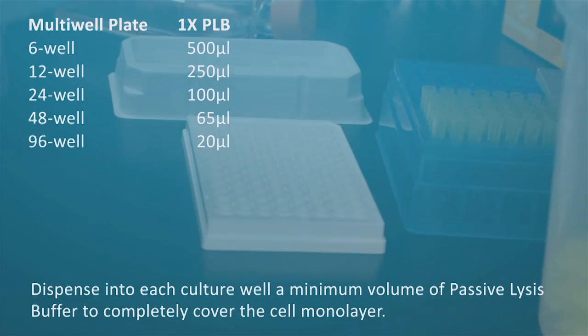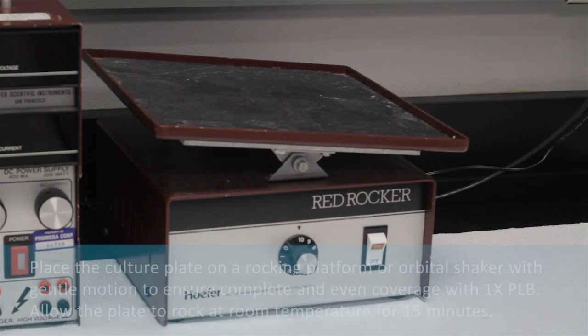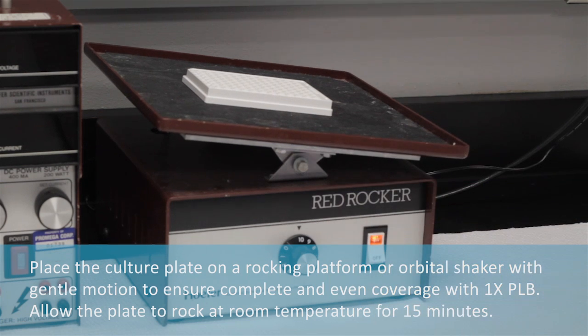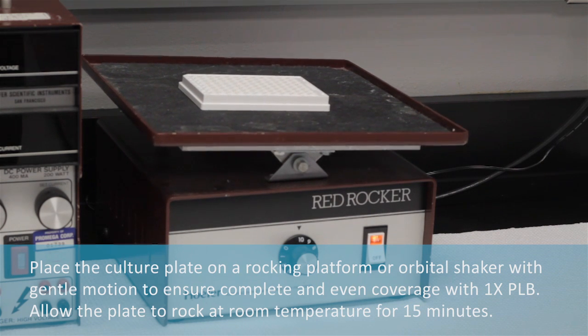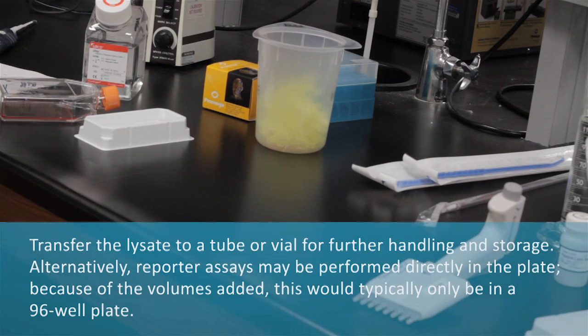Dispense into each cultured well a minimum volume of passive lysis buffer to completely cover the cell monolayer. Place the cultured plates on a rocking platform or orbital shaker with gentle motion to ensure complete and even coverage with 1x passive lysis buffer. Allow the plates to rock at room temperature for 15 minutes.